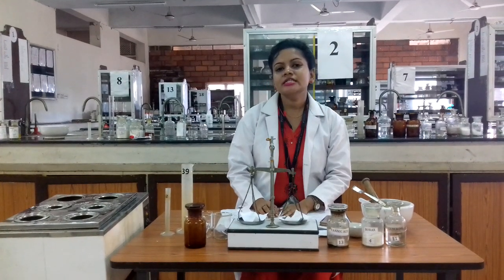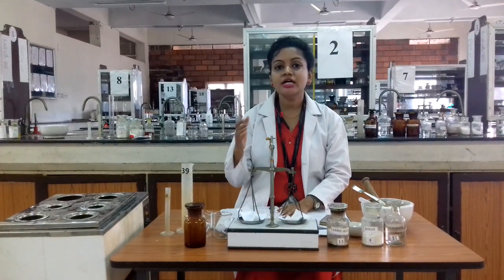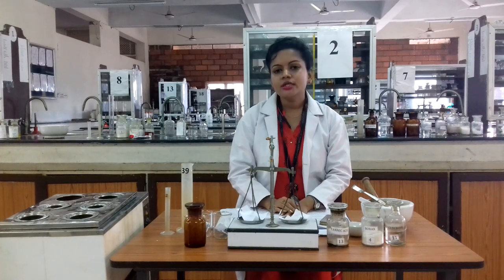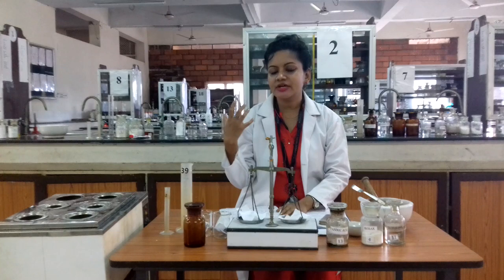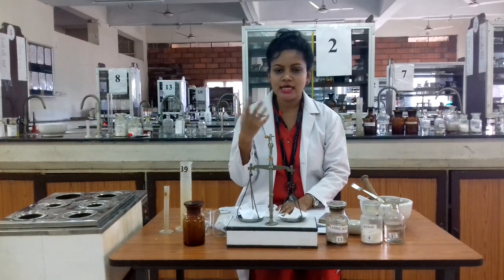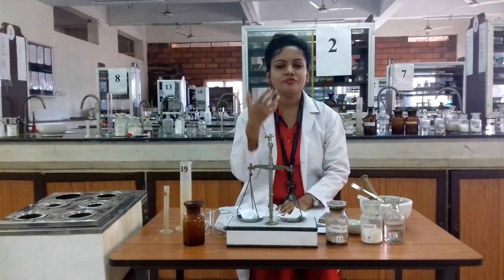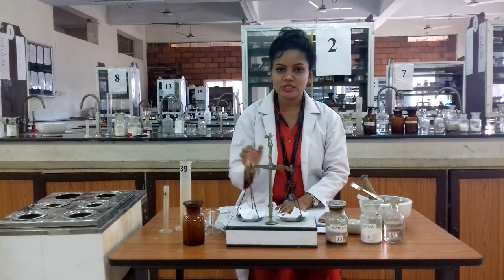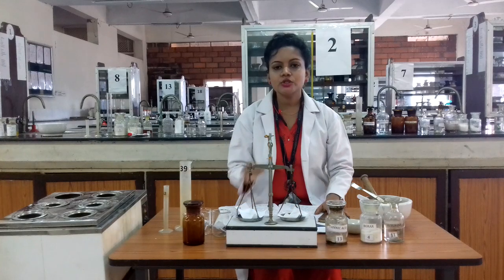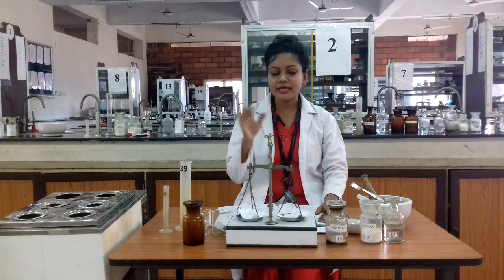Hello everyone, today we are discussing the preparation of gum pain preparations. This gum pain preparation is most effective for bleeding gums. If any inflammations or infections occur in the gum area, this preparation is most effective. So today we are discussing the gum pain preparation.